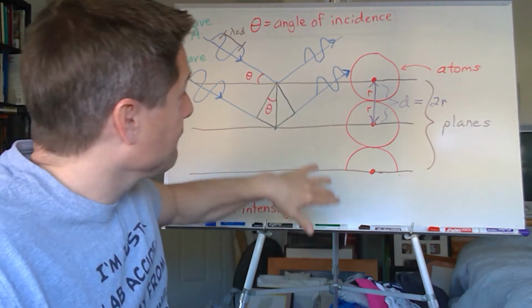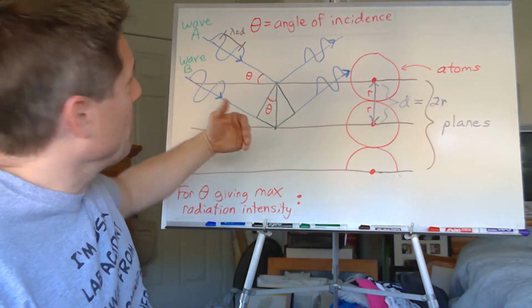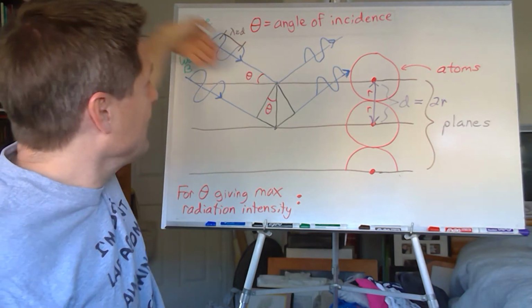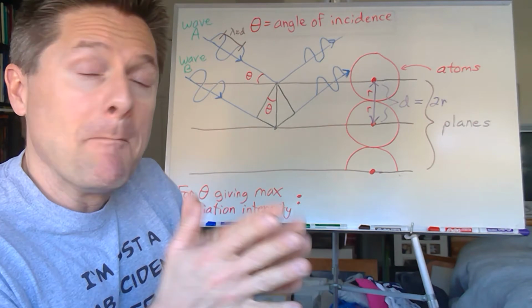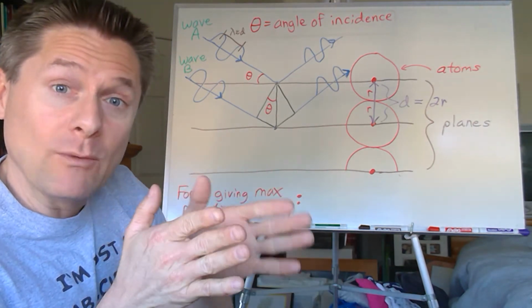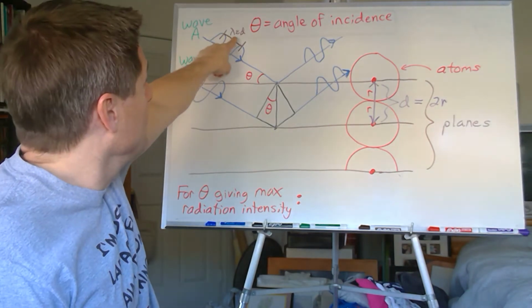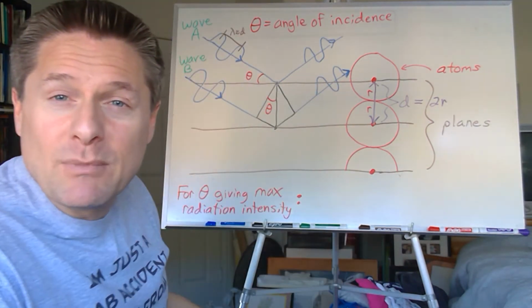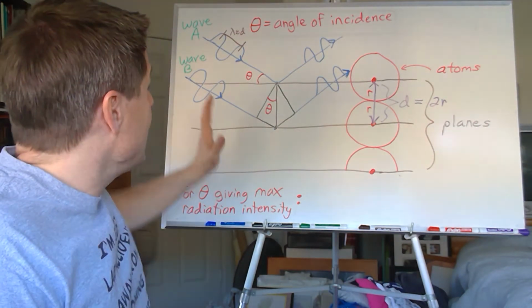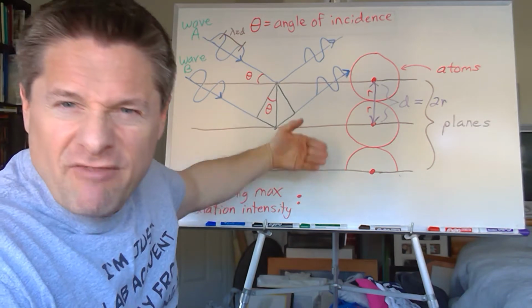We good? All right. So how does this relate to X-ray diffraction? Okay, this is what the Braggs were saying. If we have X-rays coming in, we'll look at the experiment on the next board. So we're shooting X-rays monochromatic, right? So of one wavelength. And that wavelength, the distance between the peaks, should be approximately equal to the spacing between those, right? So that's the key. And so these waves are coming in, and they don't go very deep.